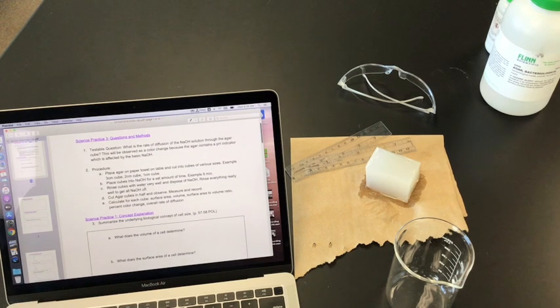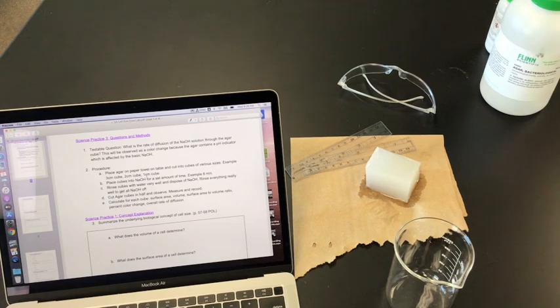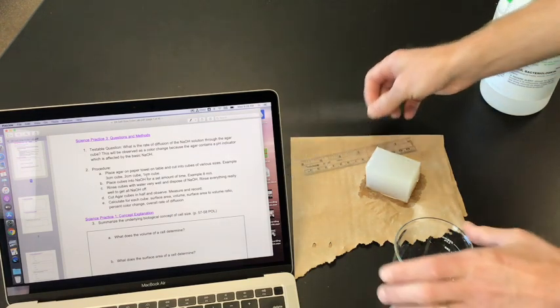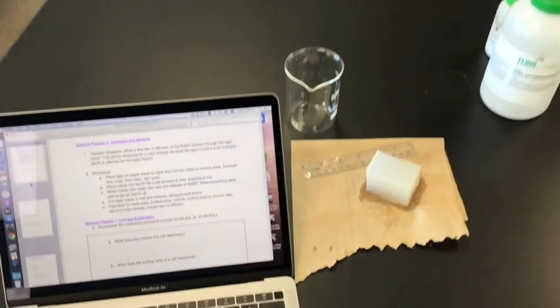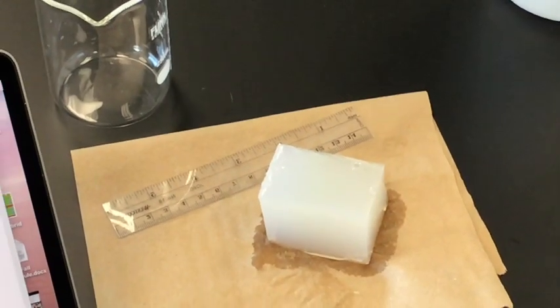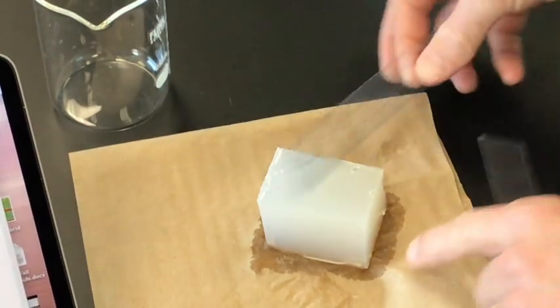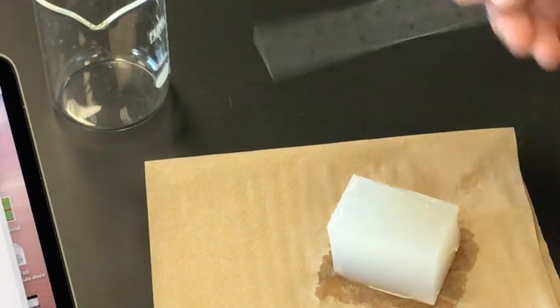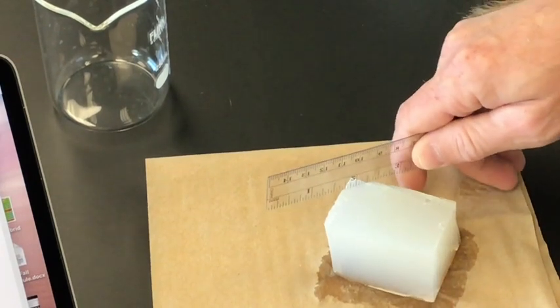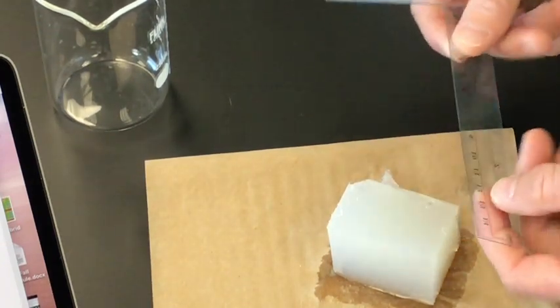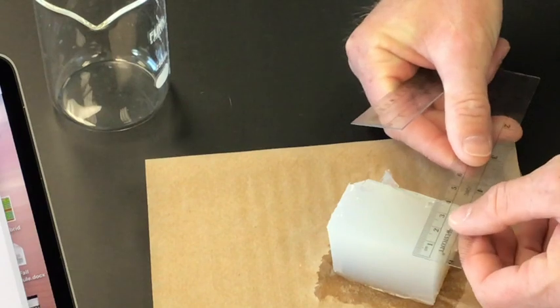All right, so we got a procedure. We're going to cut different size cubes: a three centimeter, two centimeter, and one centimeter cube. Put my goggles on here. Let me zoom in a little bit to that cube. I actually have two rulers here because the agar is actually pretty easy to cut using a ruler as a knife.